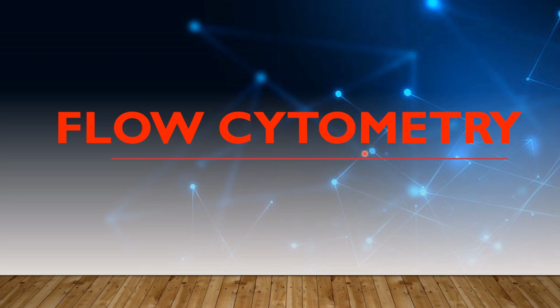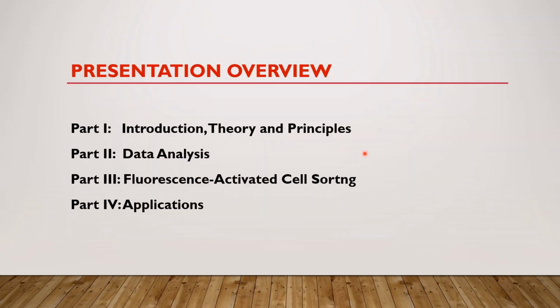...biomedical technique in cancer research and diagnostics and disease monitoring. That is flow cytometry. This presentation I have divided into 4 parts. The first part will be about the introduction. The second part will cover the basics of data analysis, where I will just explain the data plots and gating. The third part will cover fluorescence activated cell sorting, that is most important for most of the students. And the fourth part is applications.